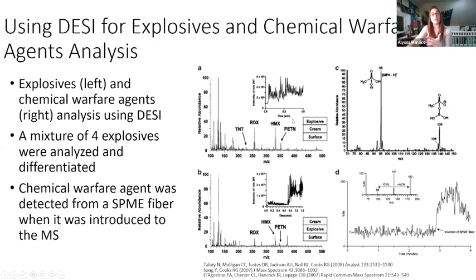This becomes really cool because now we have what we call a standoff technique, where if we have dangerous or hazardous chemical compounds like explosives or chemical warfare agents, we don't need to further prep the sample. And sample prep sometimes can release more volatile chemicals or can make your samples more hazardous and more reactive. In this case, we just hold it up to the instrument. When we're done, we put it back in its nice, safe container, and that's it. So there's minimal exposure to the analyst and minimal possibility that you're going to get hurt.